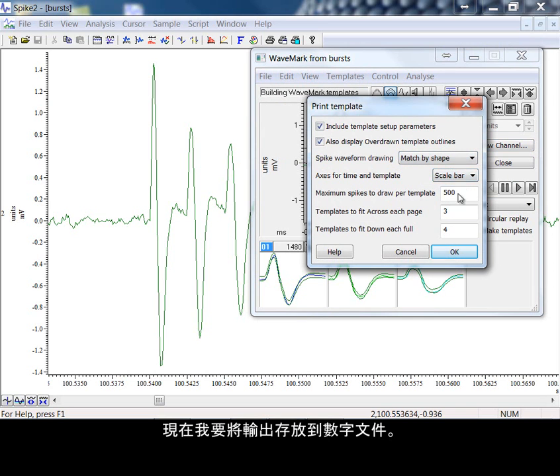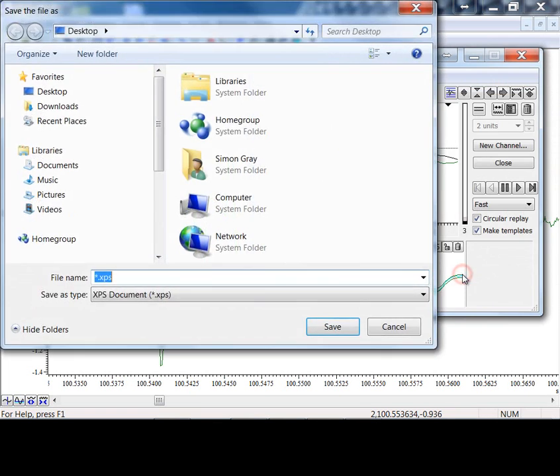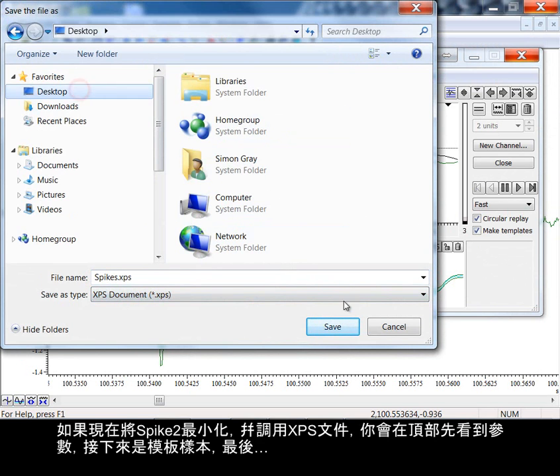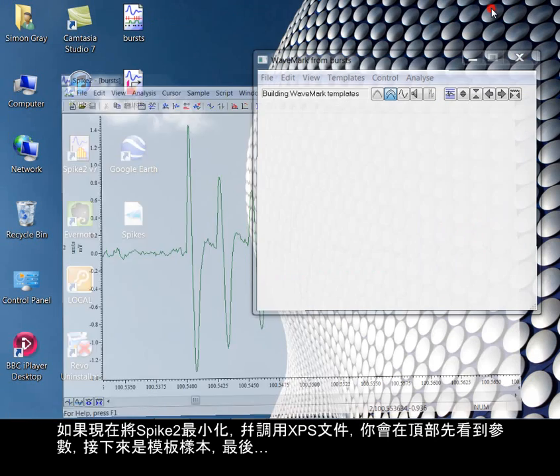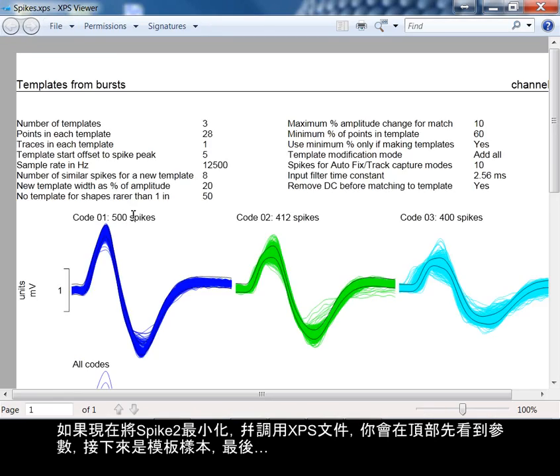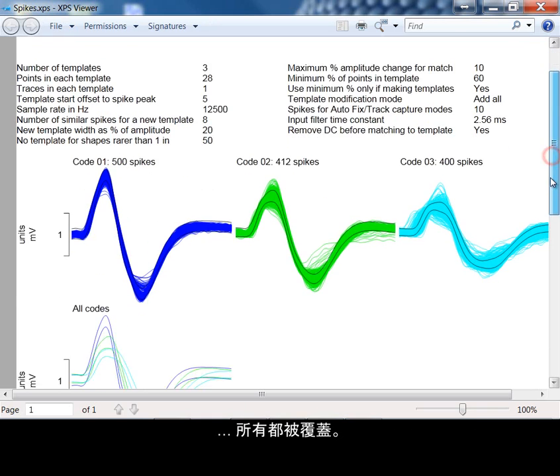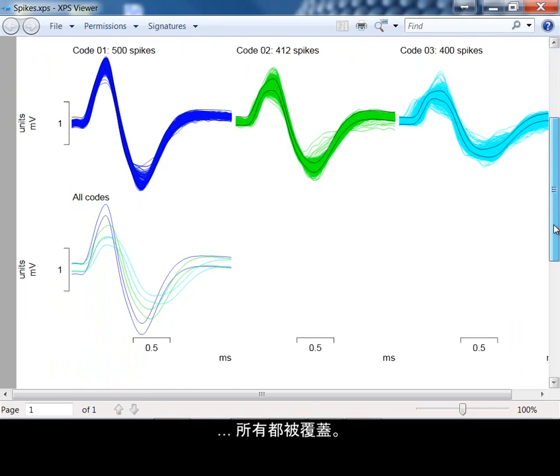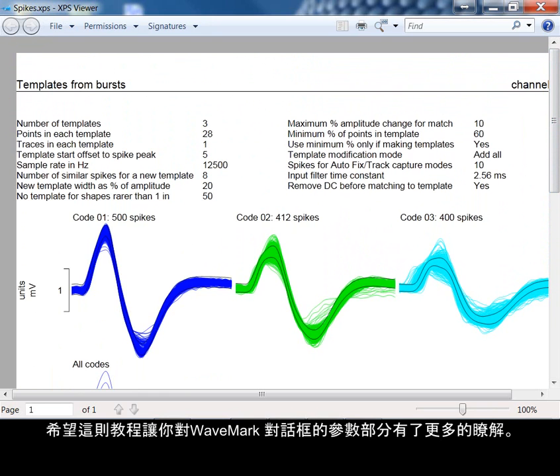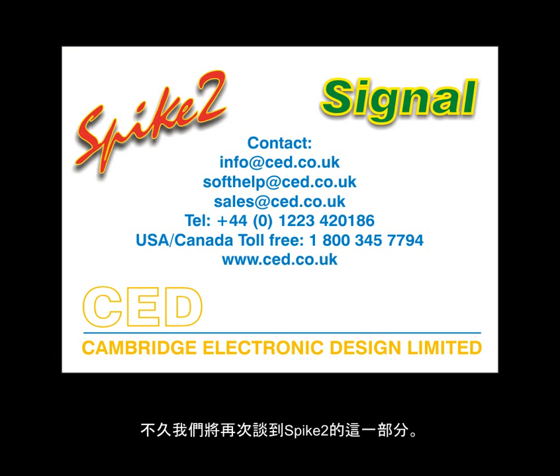Here, I'm going to take the output to a digital document. If I now minimize Spike2 and call up the XPS file, you can see at the top the parameters and below the example templates, and finally, all overdrawn. Hopefully this tutorial has given you a better insight into the parameters section of the wave mark dialog. We will be revisiting this area of Spike2 again soon.